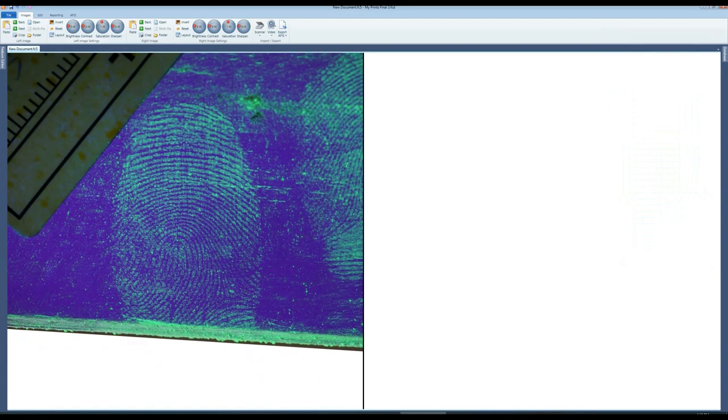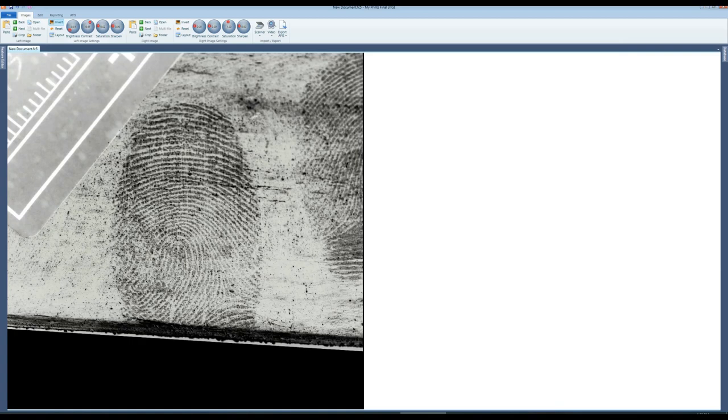Saturation first this time. Then invert. Brightness down and contrast up until satisfied.